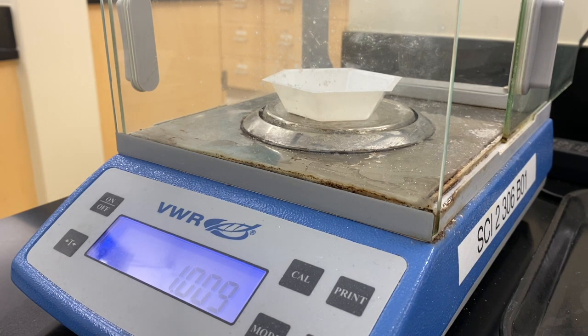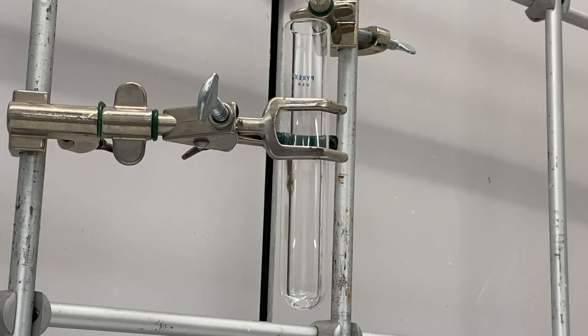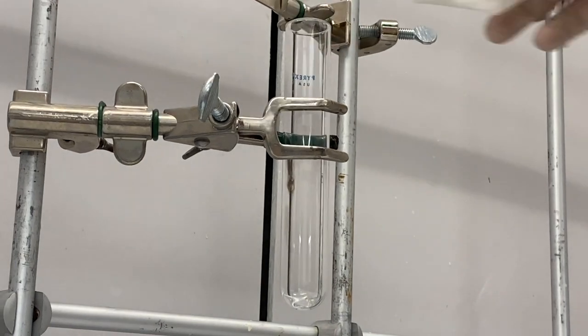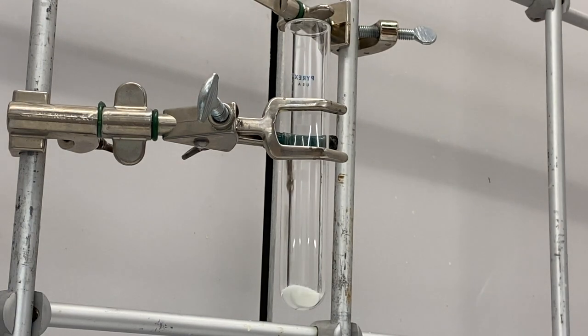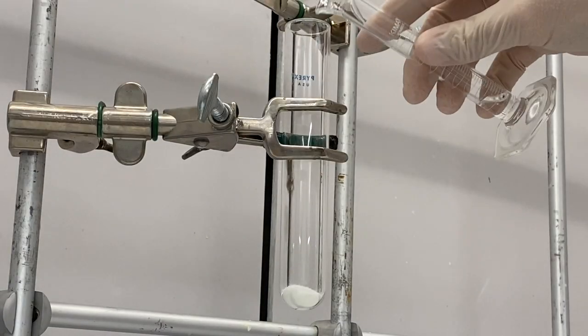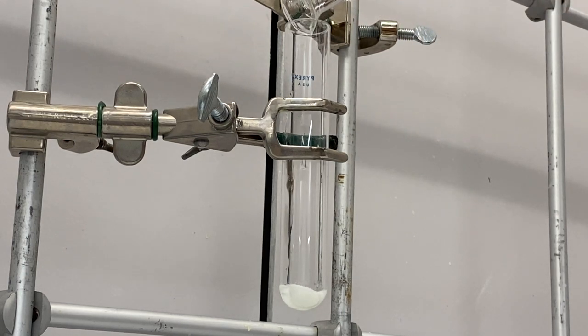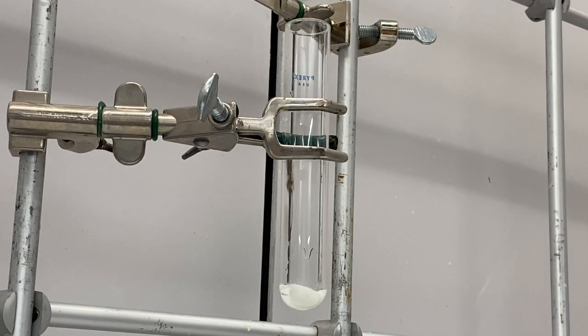That's pretty good — that is our mass of 3-nitrophthalic acid that we're going to be using. We have our test tube, we have our roughly one gram of material we weighed out previously. We've added that, and now we're going to add our 2 mLs of 8% aqueous hydrazine.